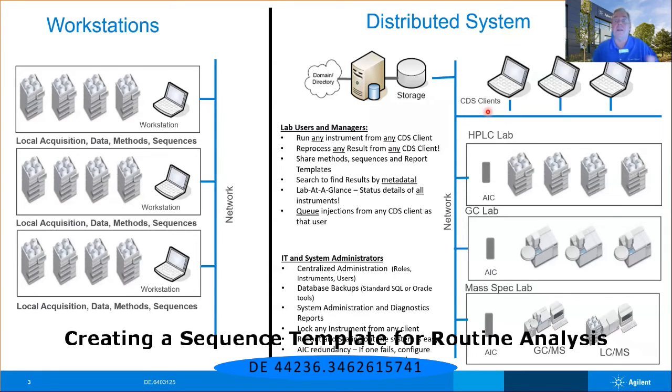And I can see if somebody is currently using an instrument prior to me sneaker netting over to the laboratory to see when I can use it. And then finally, I can even queue injections from any of my clients to run on any of these instruments. That's a very handy thing to have. Let's say one of my colleagues comes in. He sets up his 100 injection run to run overnight. It's going to end at 3 a.m. I don't want to have to come in the laboratory at 3 a.m. So instead, I can queue my injections to run immediately after his. And so immediately after his injections are done at 3, mine will begin immediately.